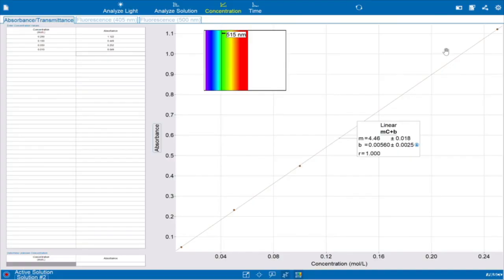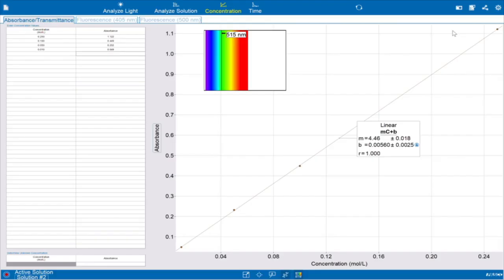Now that we've created a line of best fit with our data, we can use this line to approximate the concentration of our unknown by measuring the absorbance and comparing it to our line. Before you leave lab, you will get a test tube filled with an unknown concentration of cobalt 2 nitrate from your TA. Make sure to record the code given on the test tube in your lab report, and then measure the absorbance of your unknown solution in your spectrometer. This will allow you to calculate the concentration of the unknown using Beer's Law and the molar extinction coefficient you found from your line. That sums up everything you'll need to know for this experiment. Good luck!